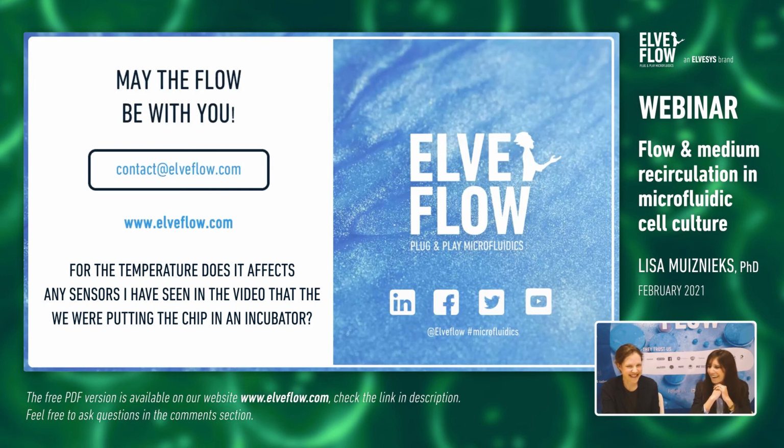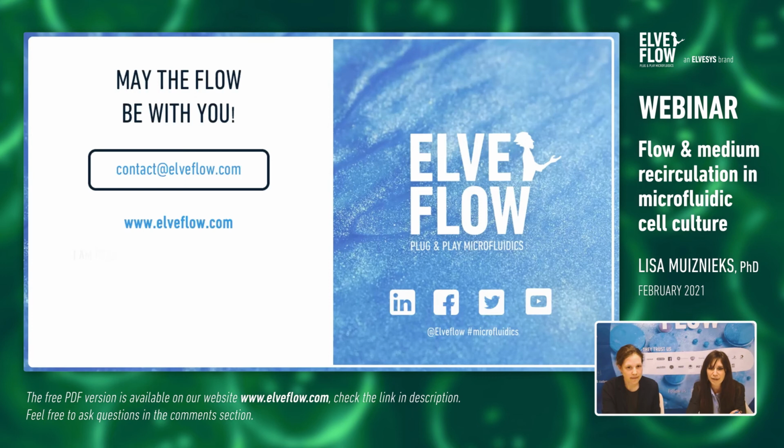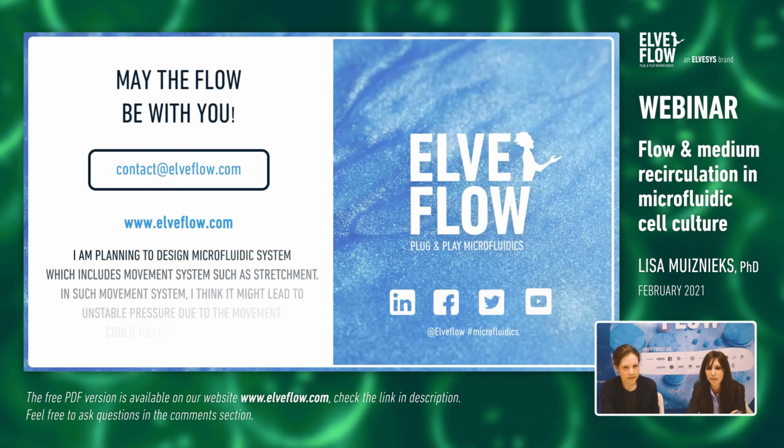Thanks, Agar. So from Andy: thank you for the great presentation. I'm planning to design a microfluidic system which includes movement systems such as stretching. In such a movement system, I think it might lead to unstable pressure due to the movement.